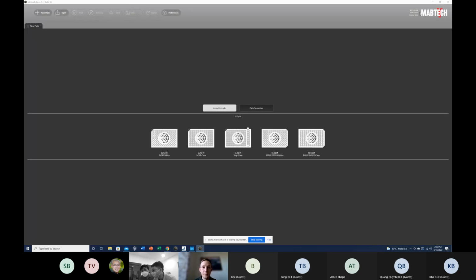You turn ASTOR on. So now ASTOR should go from off to booting. Can you see this? Yes. Great. This will take around 30 seconds and then it reaches status ready. This is something you could do when starting up the equipment, when you're installing it, logging in and making sure that the equipment goes from off to booting to ready, to make sure that the entire process of setting up the equipment is correct.